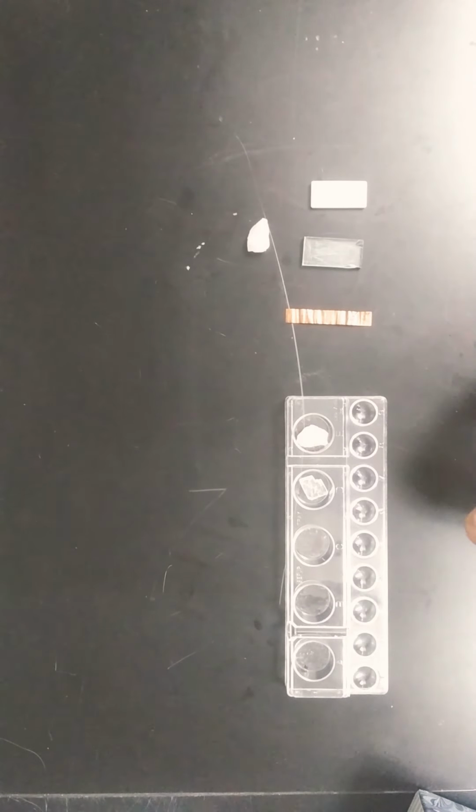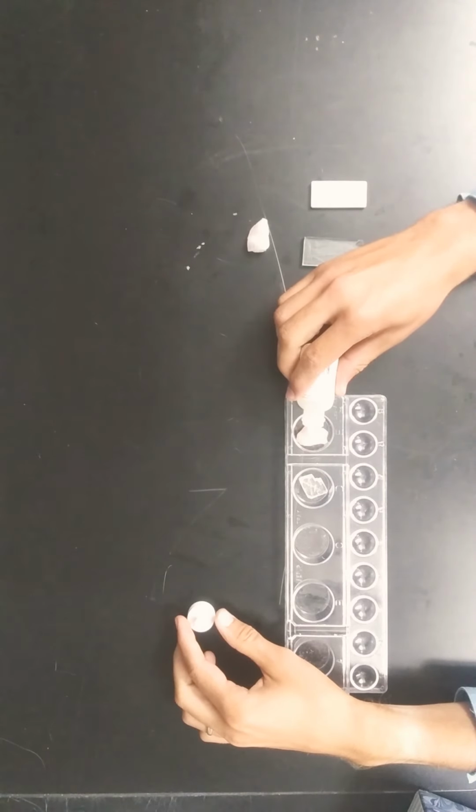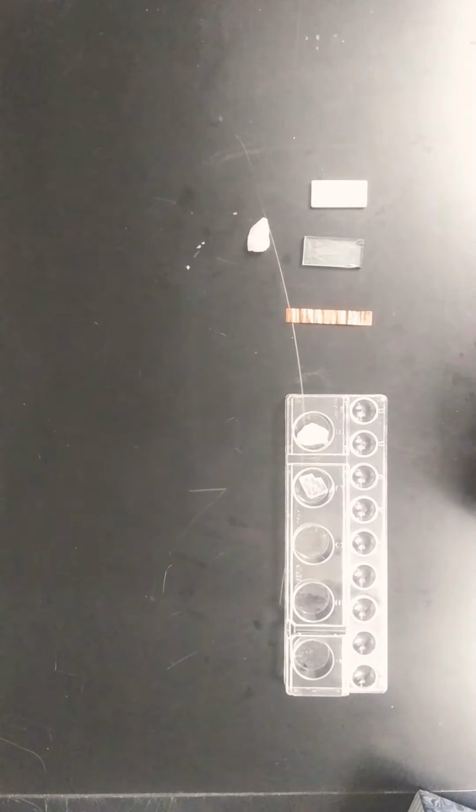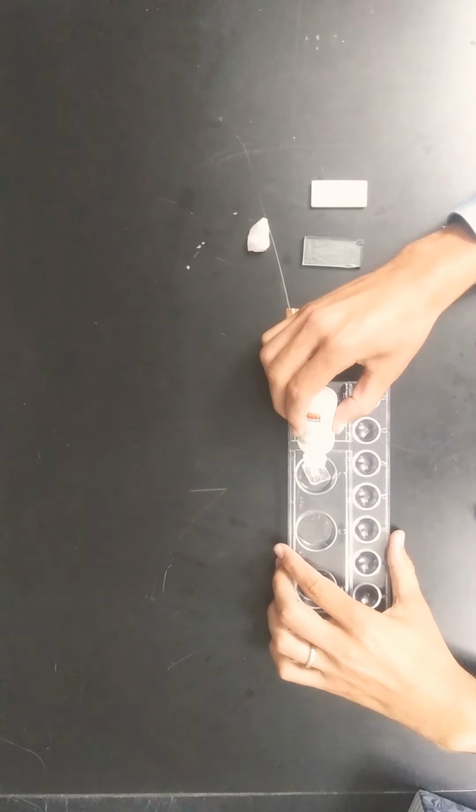So we're going to very carefully, while wearing our goggles, drop a drop of acid on our sample. And if we look very carefully, we see that nothing happens. That's right, this sample does not react with acid. If I do drop a drop of acid on the calcite, you'll notice immediately it starts to bubble. It creates bubbles and fizzes, and it has a very strong reaction to the hydrochloric acid.